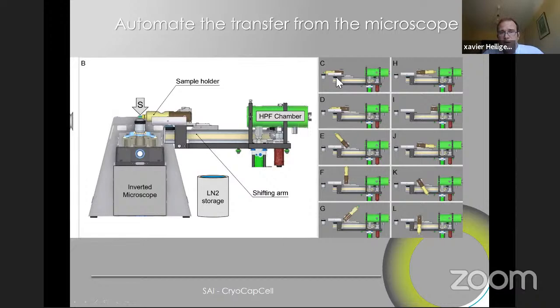So the whole process from this live cell imaging to the high pressure freezing nowadays with our machine is 1.2 seconds. So basically, this is something which has gone extremely fast, from 1 minute to less than 2 seconds, and which is reproducible because it's a machine that does the job and no longer a human. So this is quite important, because then from one experiment to the other, we're pretty sure that it will look pretty much the same, and the duration of the gap between the last image and the freezing is registered, so you know exactly what happened and how long it took.